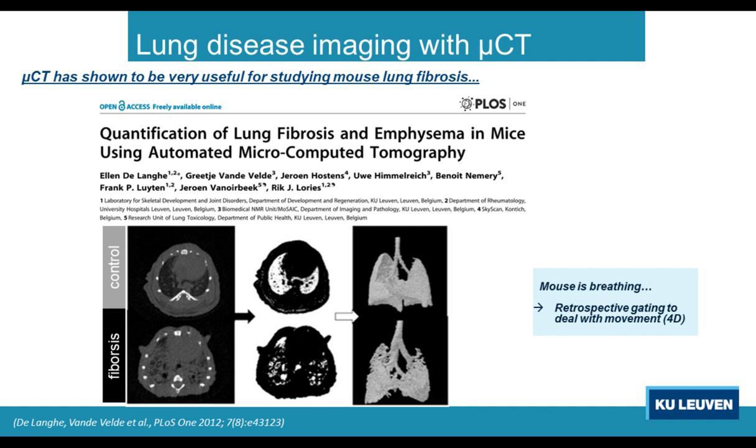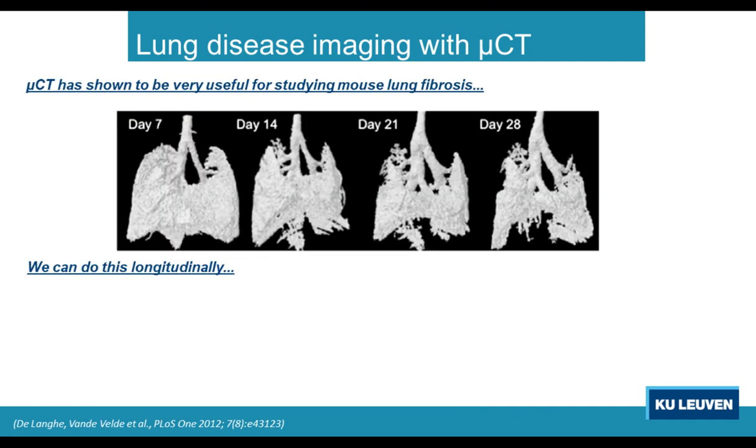And this is a measure for how much fibrosis and how sick these animals are. And this we can do longitudinally. So that's the power of microCT. You can really follow up your animals and follow up disease progression week after week after week.